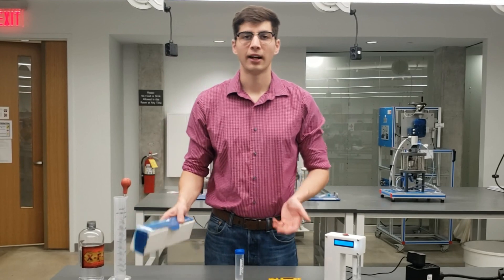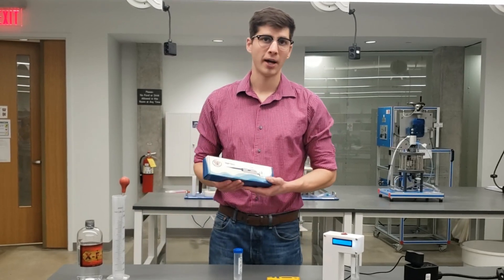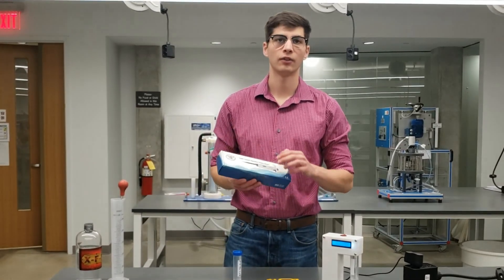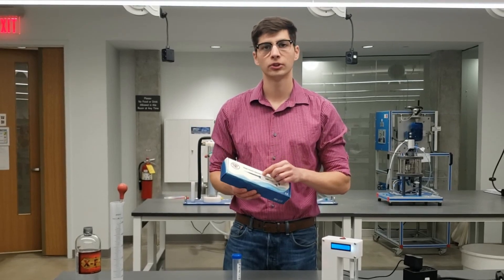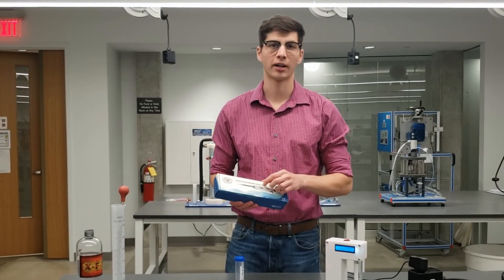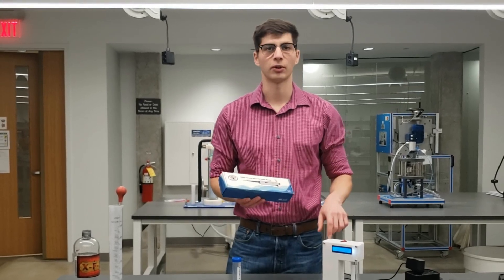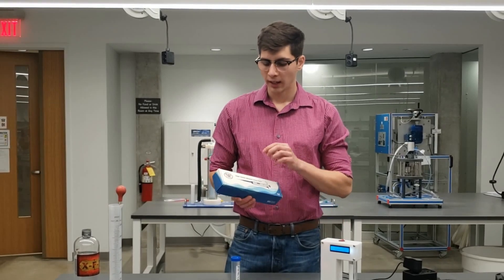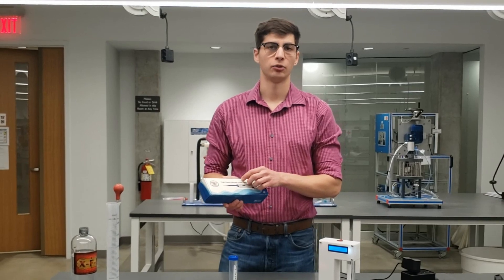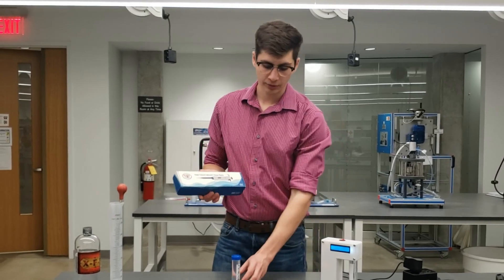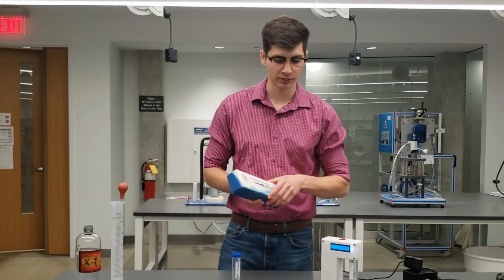The second thing that I would recommend is a pipette, and especially if you're testing hard kombucha or beer or seltzer, I would recommend having a pipette so that you can do precise dilutions in order to run them through the detector. It's also recommended to have one of these to prepare your standards like the 0.5% alcohol standard.